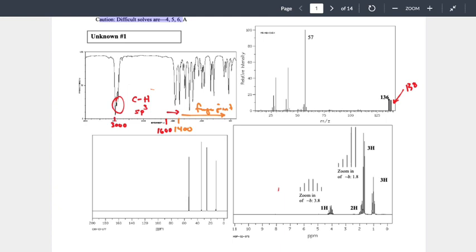Okay? Are there other potential formulas that could work? We have 0 evidence for any other element. So all we can do is really work within this. We tried to change bromine, it didn't work. We could try and change carbon. We can't change carbon upwards because we don't have enough to fit more than 4 carbons. But what about dropping the carbon downwards? Could I have the formula C3H, I don't know yet, bromine? Is that possible?